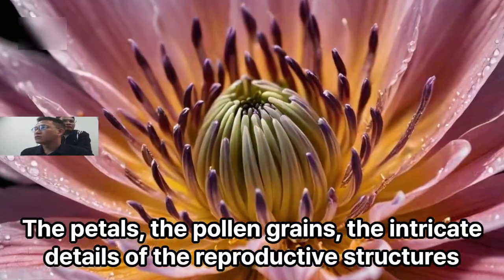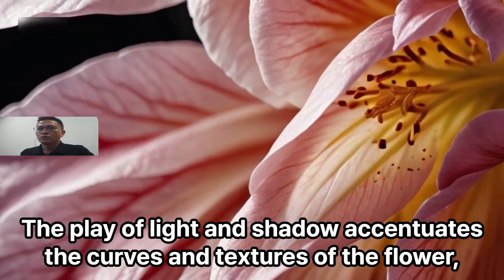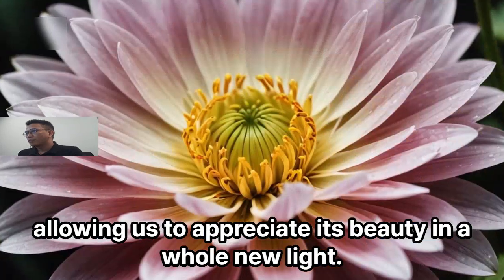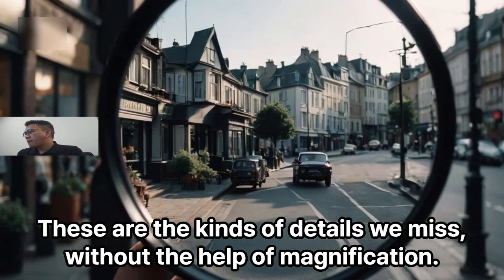The petals, the pollen grains, the intricate details of the reproductive structures, all are brought into sharp focus. The play of light and shadow accentuates the curves and textures of the flower, allowing us to appreciate its beauty in a whole new light. These are the kinds of details we miss without the help of magnification.